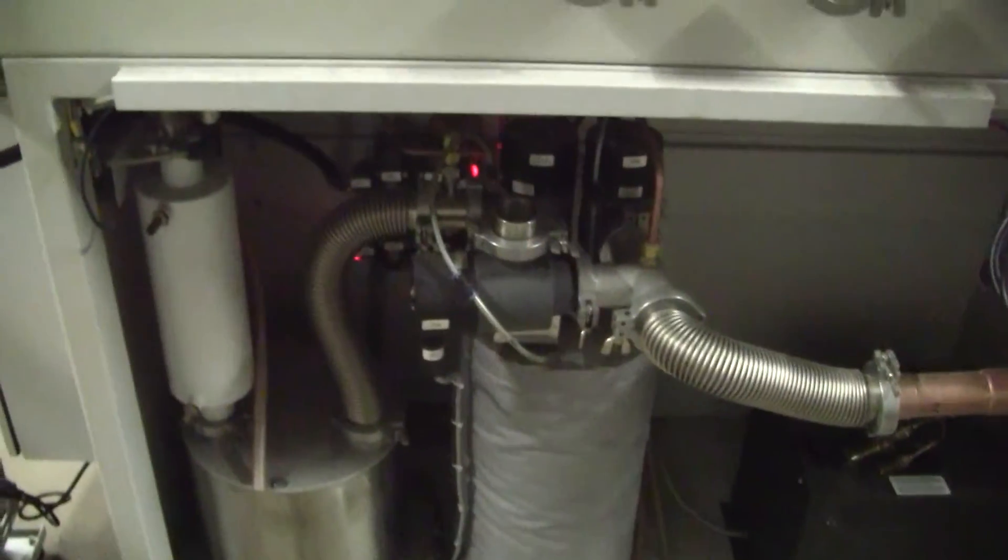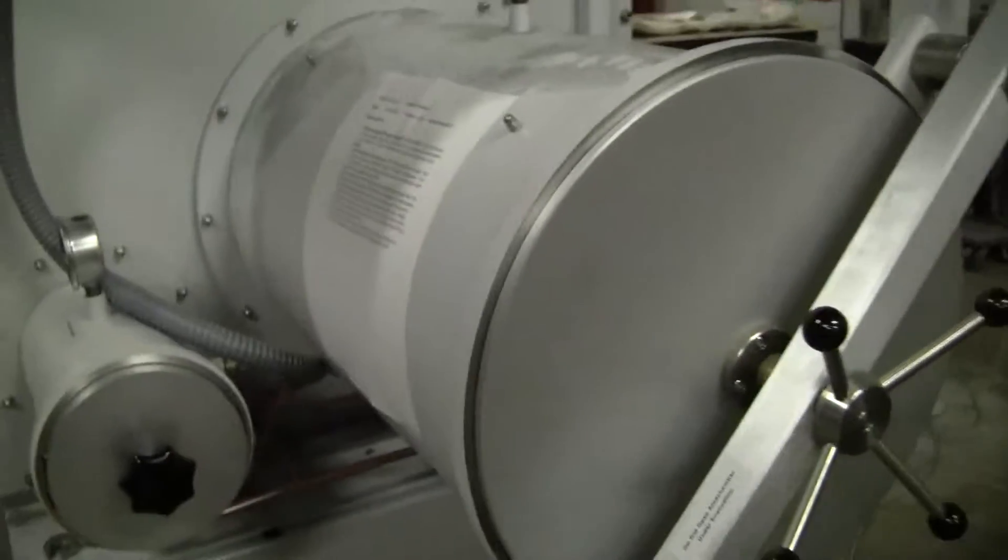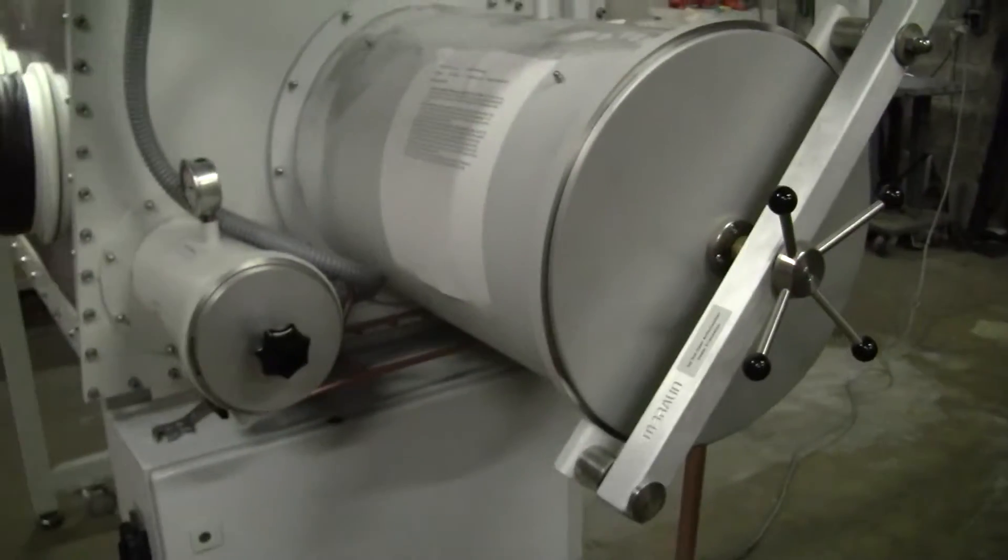Refrigeration system, regeneration system, chamber side.